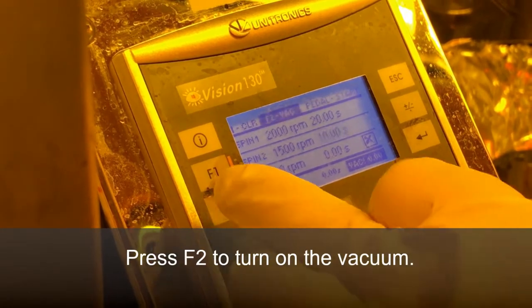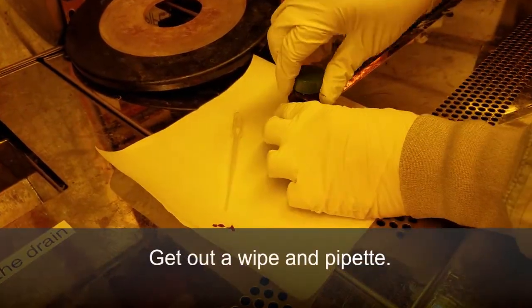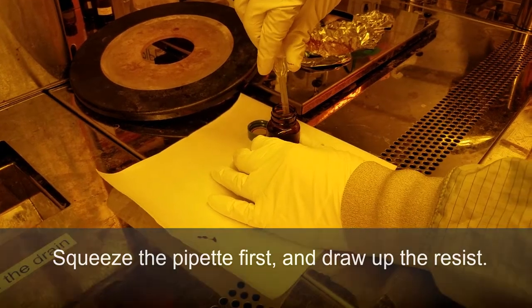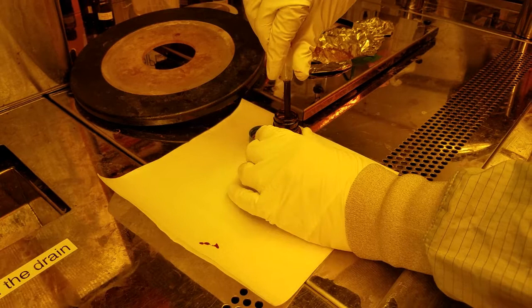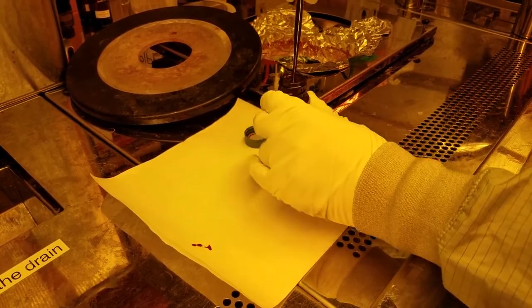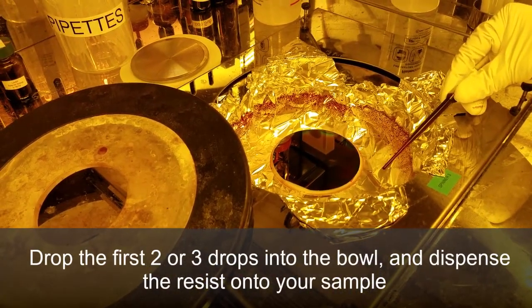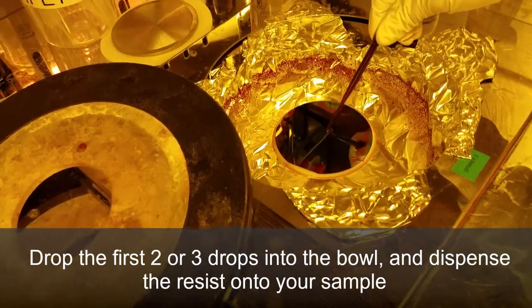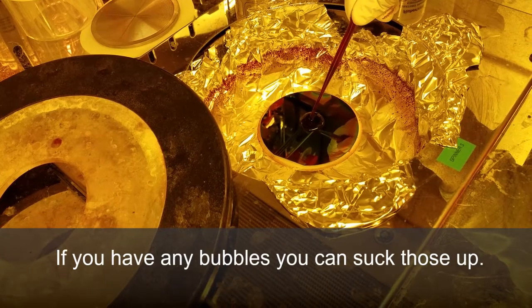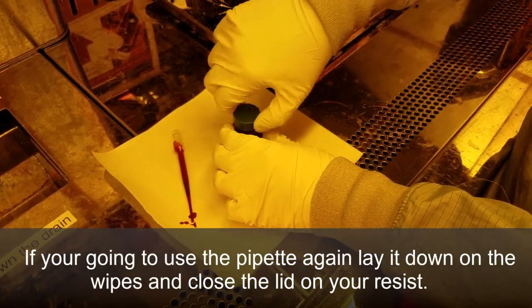Press F2 to turn on the vacuum. Get out a wipe and pipette. Squeeze the pipette first, then draw up the resist. Drop the first two or three drops into the bowl and dispense the resist onto your sample. If you have any bubbles, you can suck those up. If you're going to use the pipette again, lay it down on the wipes and close the lid on your resist.